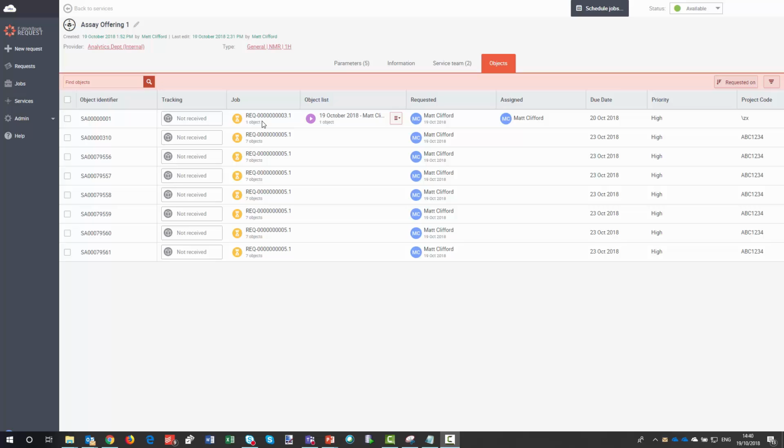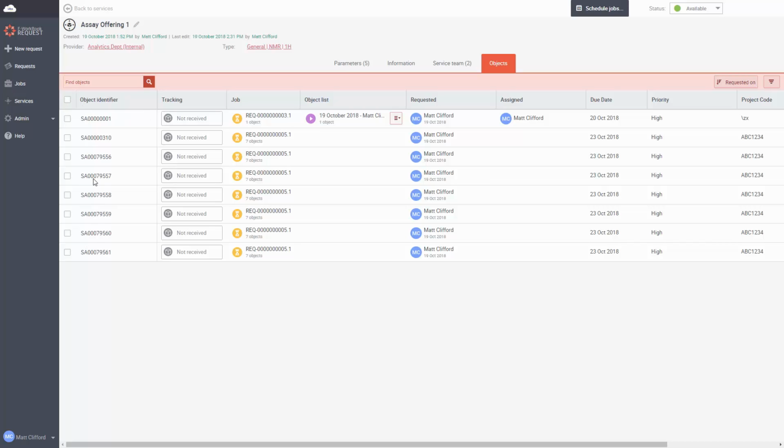First of all, I am logged into a service. I'm on the analytical team. I've been asked to do some work. This is all of the work that has been requested that at the moment has not been completed. And we can see the samples are listed here.